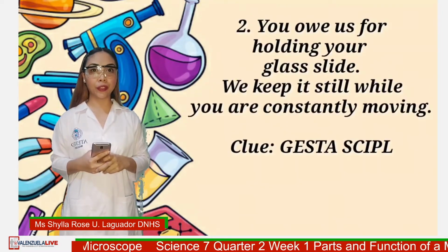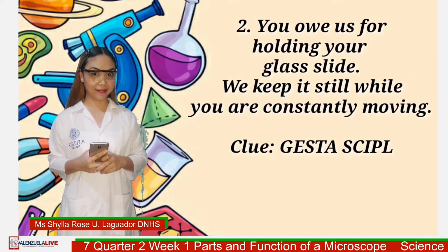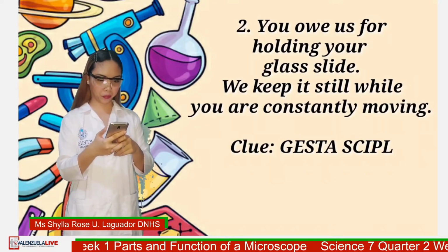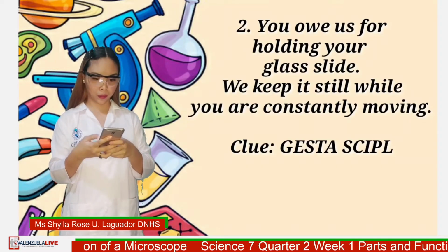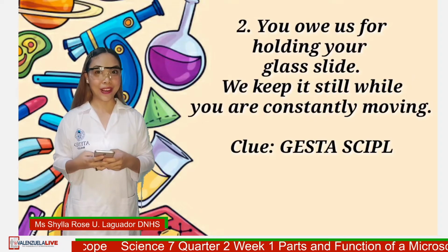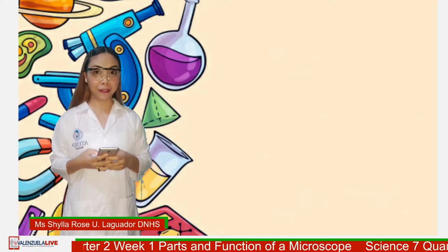You owe us for holding your glass slide. We keep it still while you are constantly moving. Guess who we are? Your time begins now. Okay, so the correct answer is stage clip or stage clips. Okay, let me read for you riddle number 3.